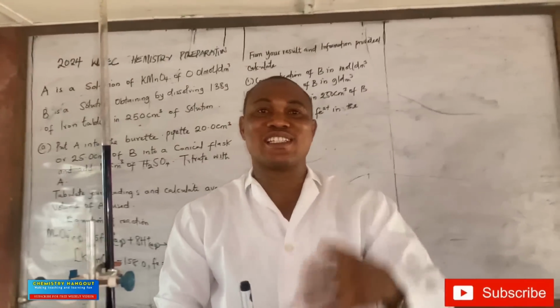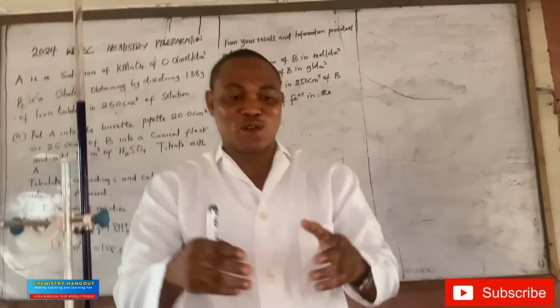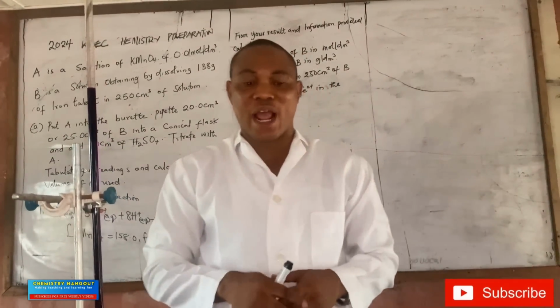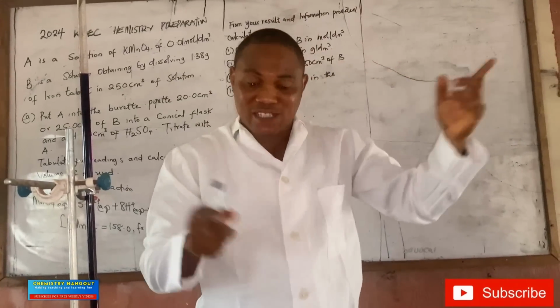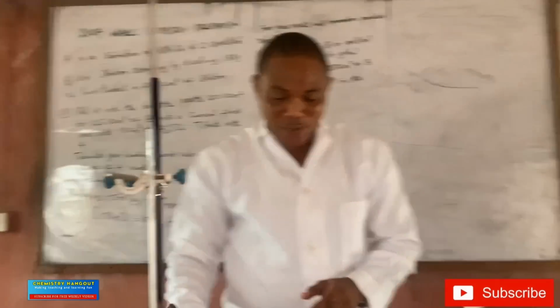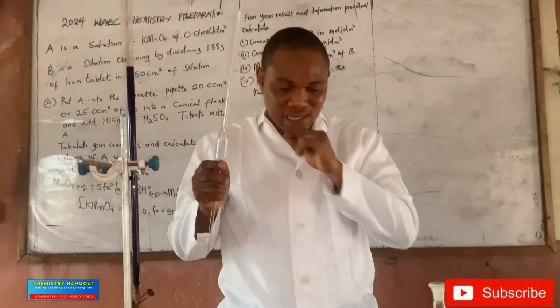I don't believe you have watched the last class where I did the laboratory preparation. So today I'll be talking about the predicted question for the 2024 WAEC practical. I have done the titration in my last video, but let me just quickly complete the titration so we go to the question. So let me do the titration again. I think I'll just do that once so that I will not waste time.